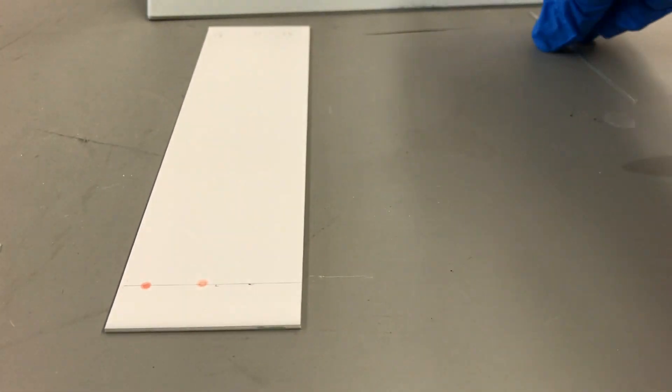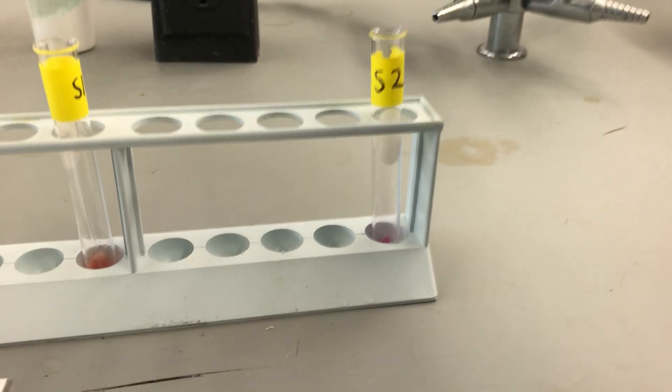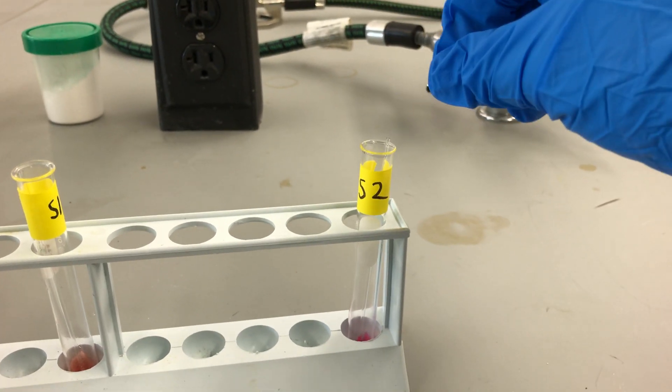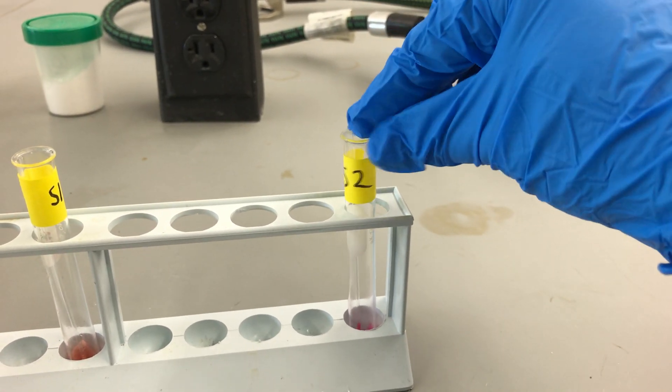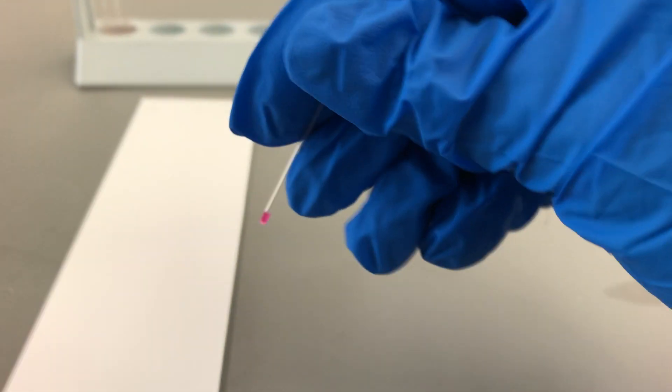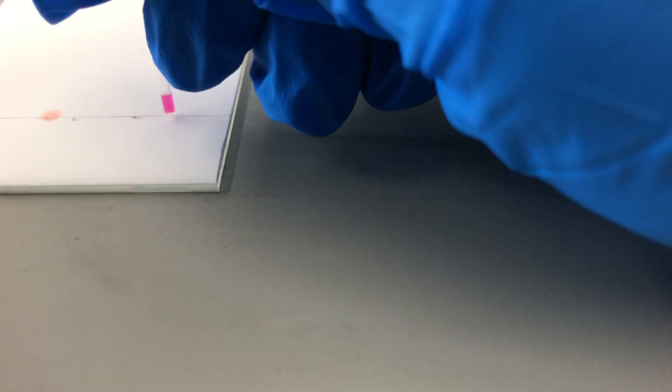Let it dry completely before you apply another sample, and then we're going to do the same thing with our second suspect sample. So capillary tube in, remove, and then once again right onto the line.